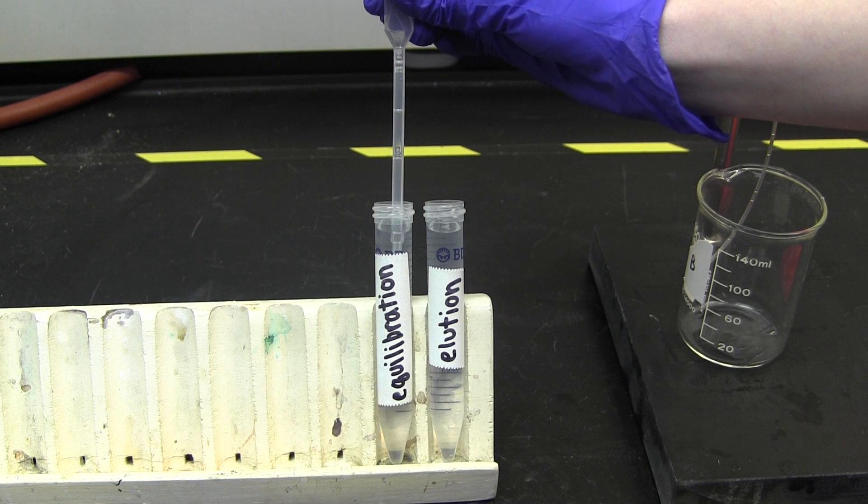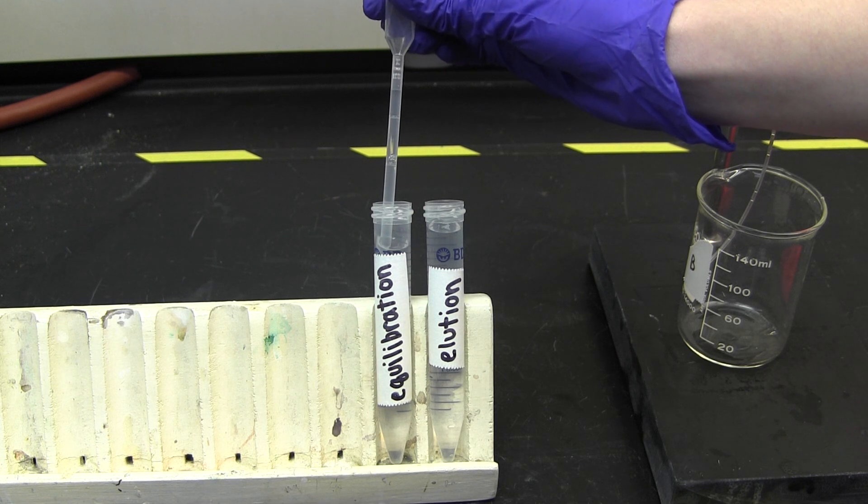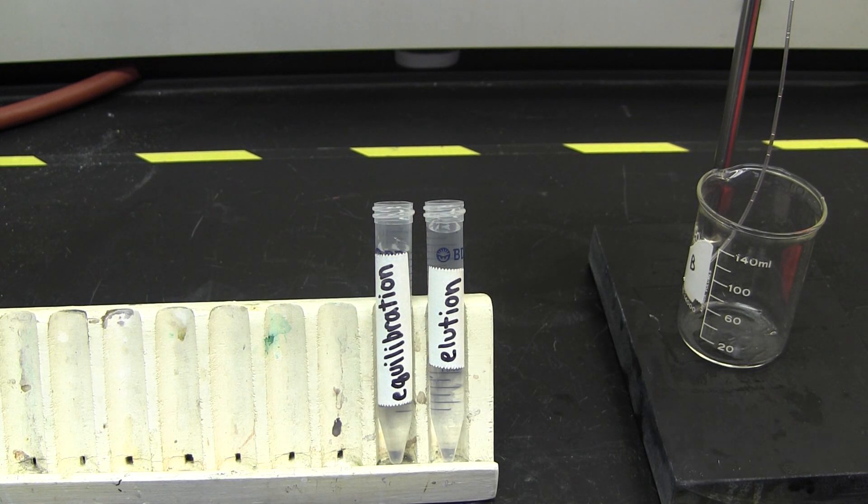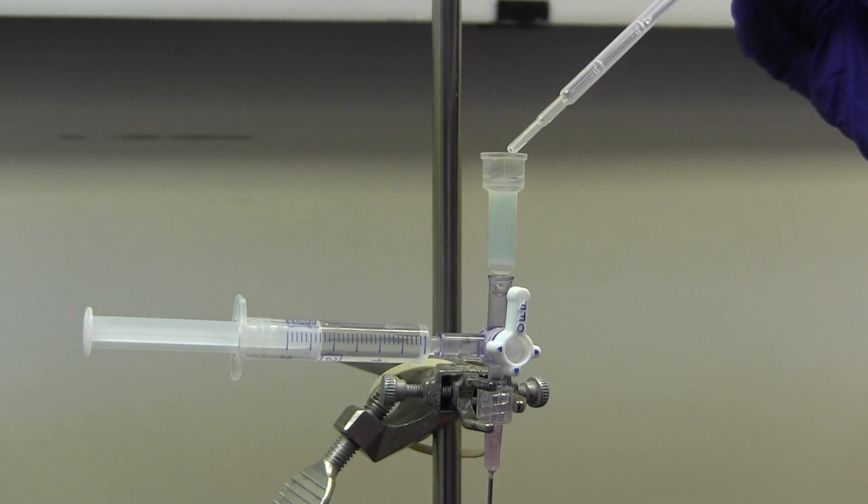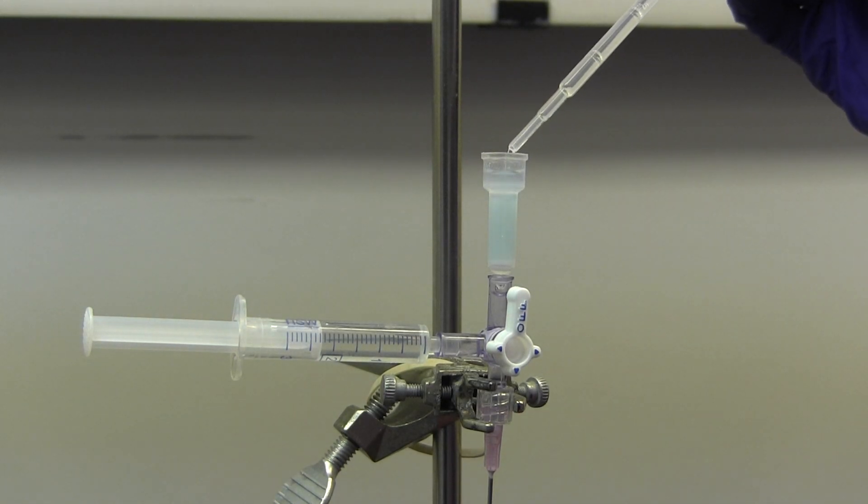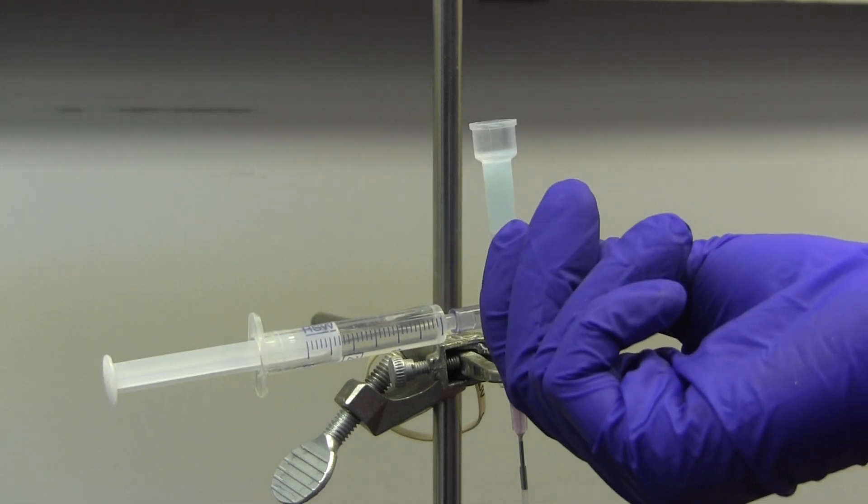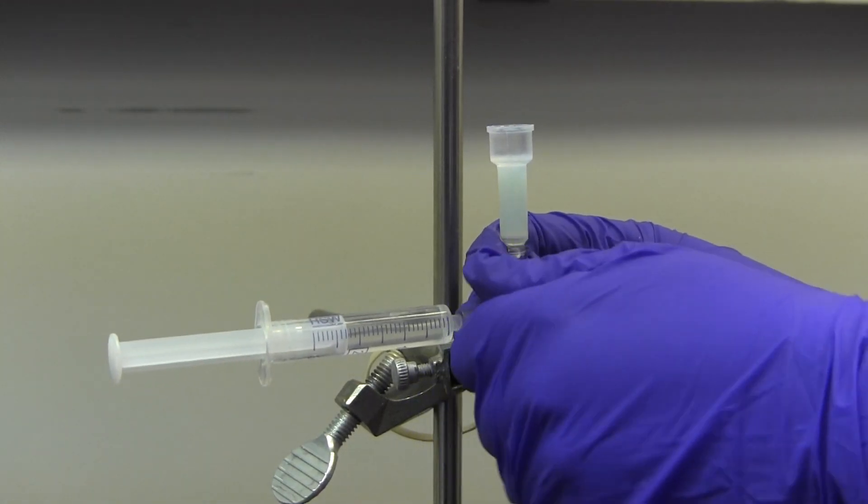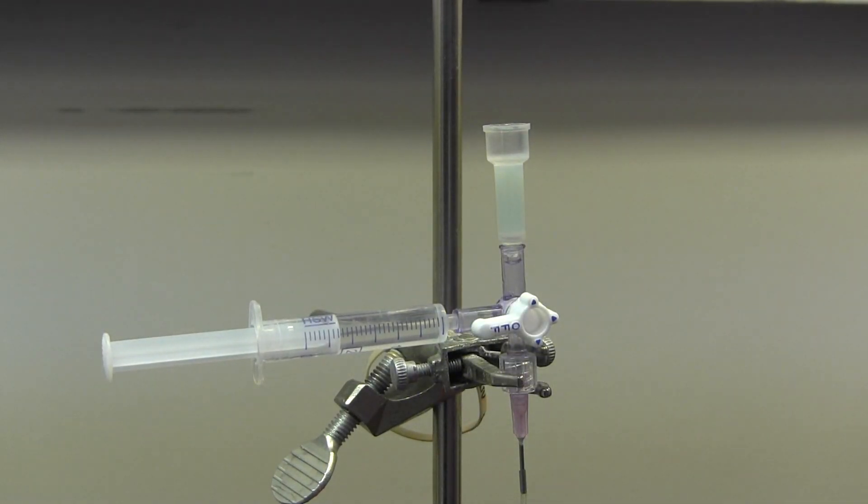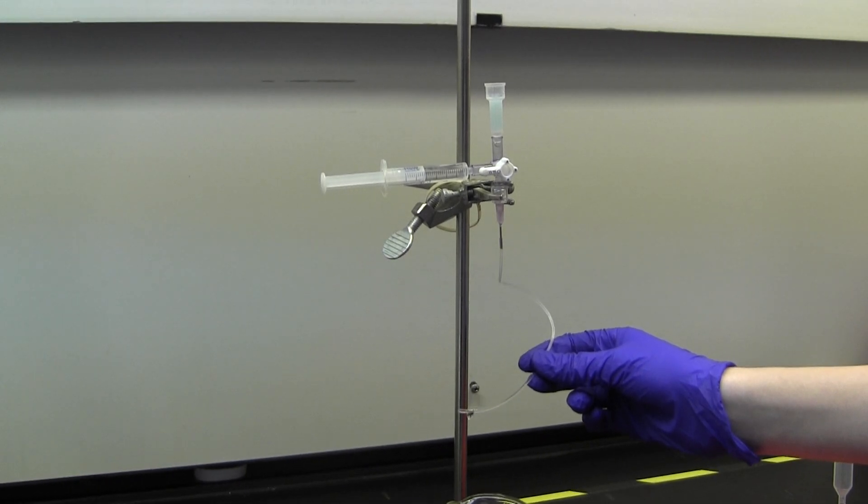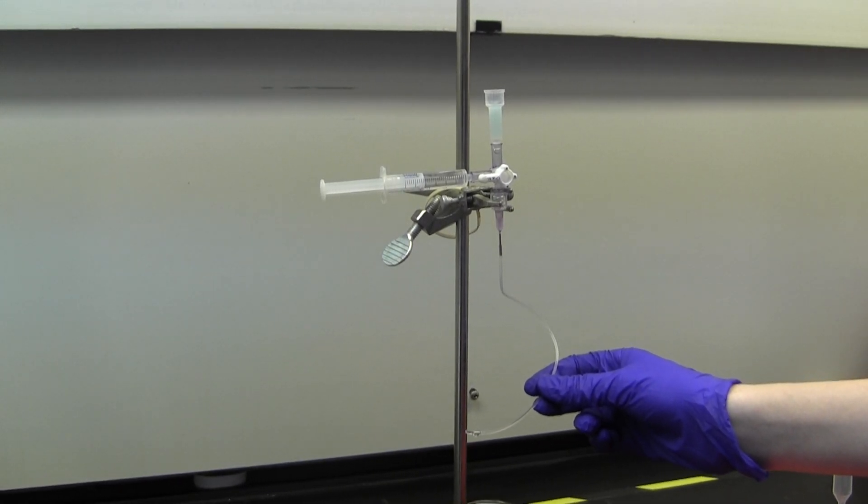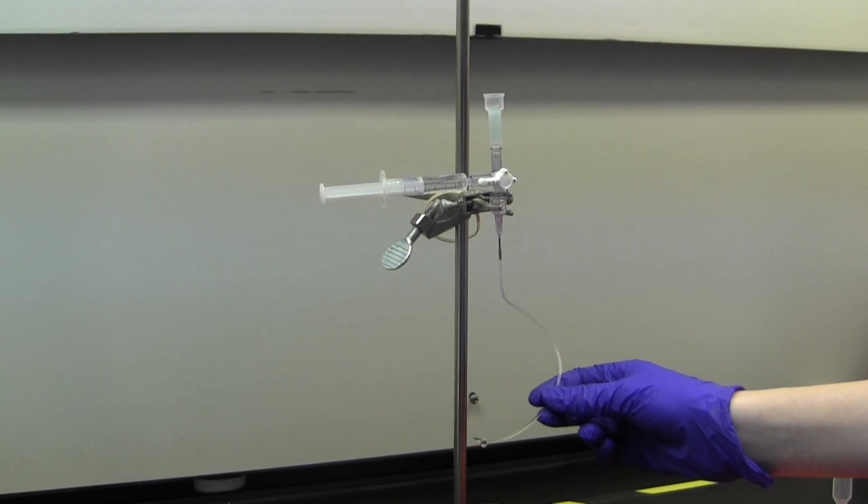First, wash the column with 5 column volumes of their equilibration buffer. Do this 1 milliliter at a time and do not let the resin run dry. While this is washing, adjust the displacement of your column by moving it up or down the ring stand or change the position of the tube. The column should be dripping at a rate of about 1 milliliter per every 2 minutes. It is crucial that you do not rush while collecting fractions.